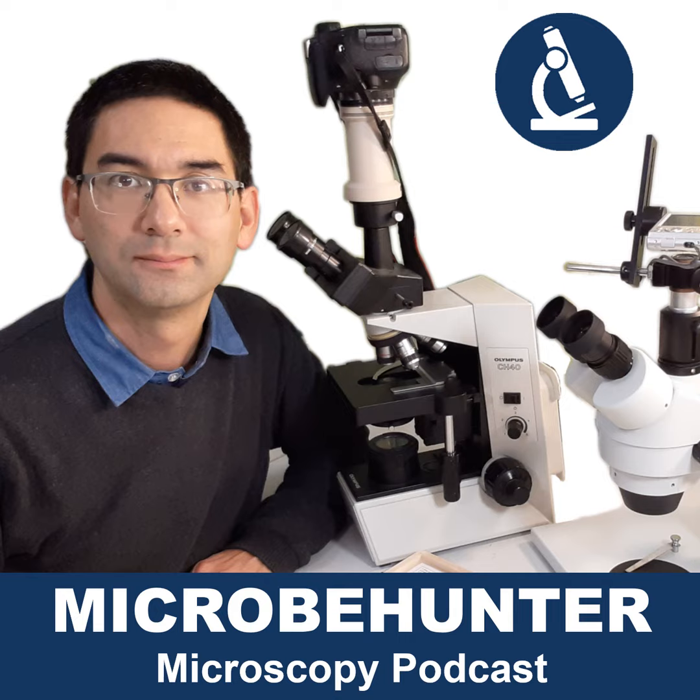But I myself have been a little bit involved, because I tried to make a microscope out of Lego. And in my blog, I have actually reported back on that. So I bought myself the optics, and I simply built a Lego microscope around it. And it works. What shall I say? Why shouldn't it work? It's basically building a box around an objective, right? That's what I did. It was quite fun. You can read up on my blog a little bit.